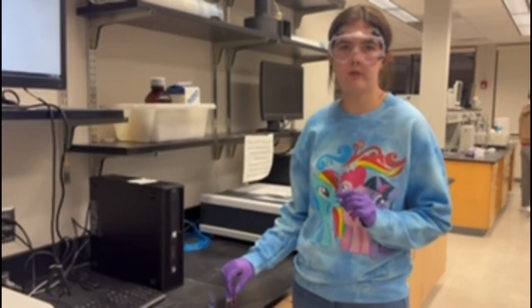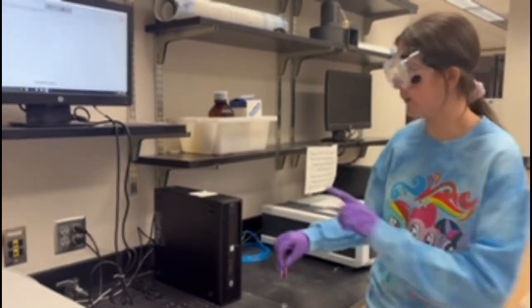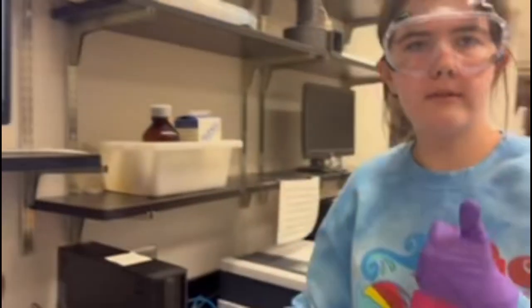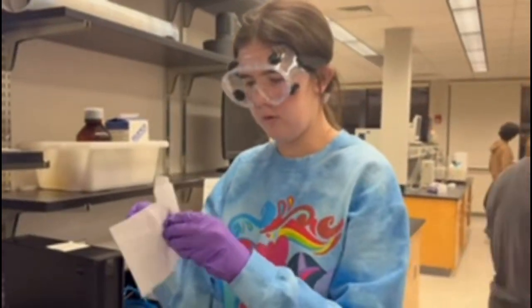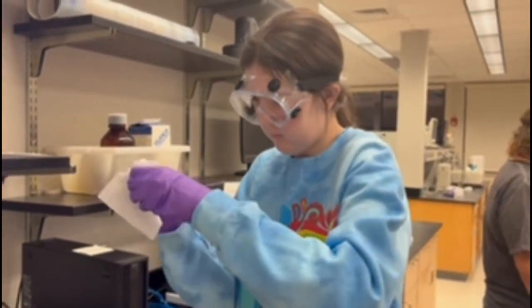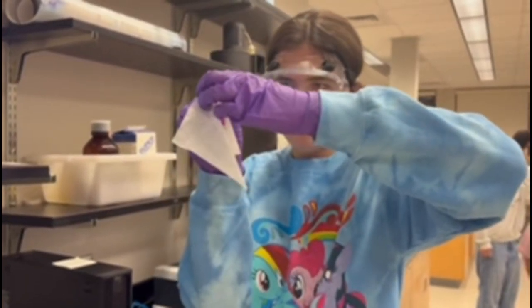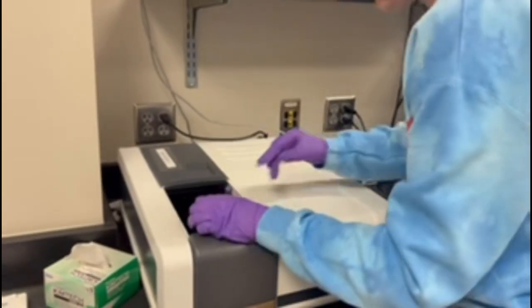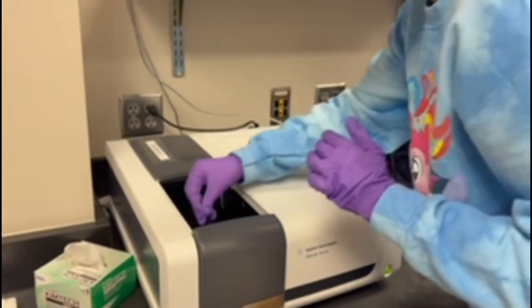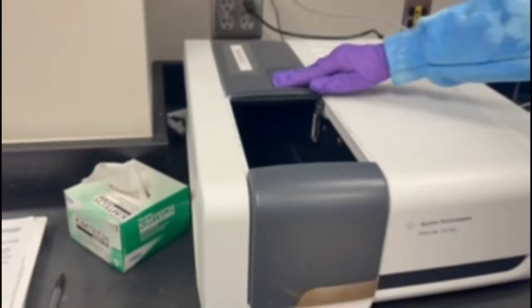Okay, before you start your spectrophotometer, always make sure that it's at 0, or that it's close to 0. This is working. When you get your cuvette, make sure that you wipe 2 sides completely clean, like this, 2 sides. Open the scanner, and make sure that you put your cuvette in with the sides that are clean facing the light. Close up. Now close the scanner before you read it.